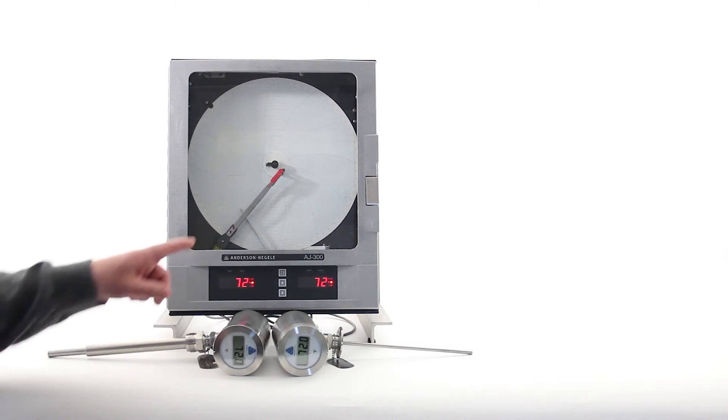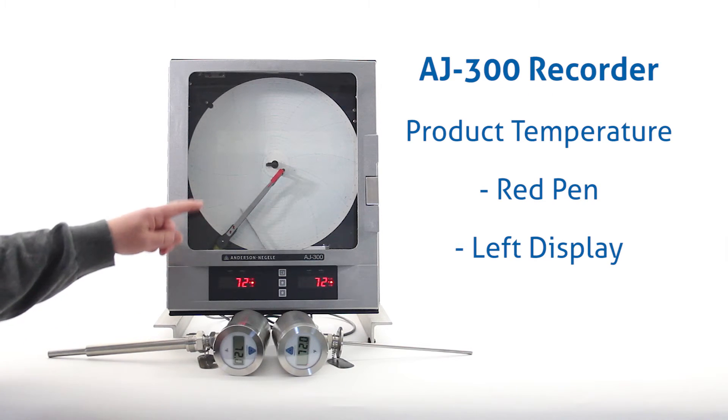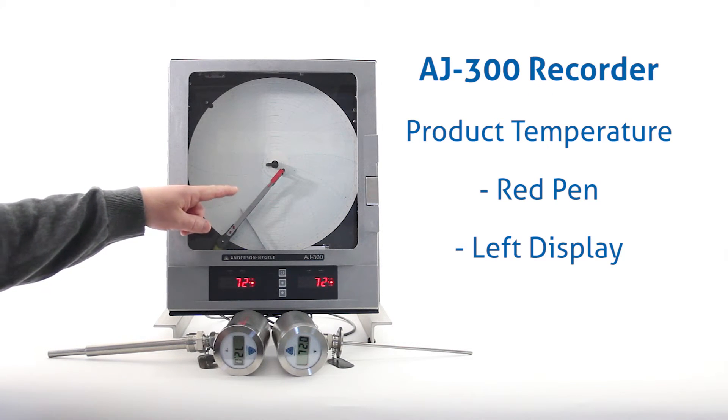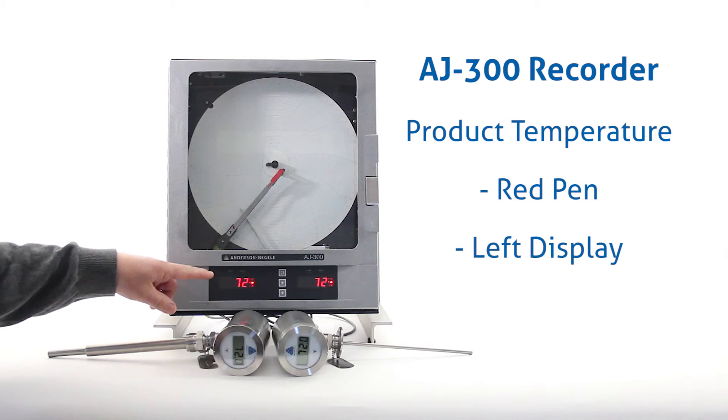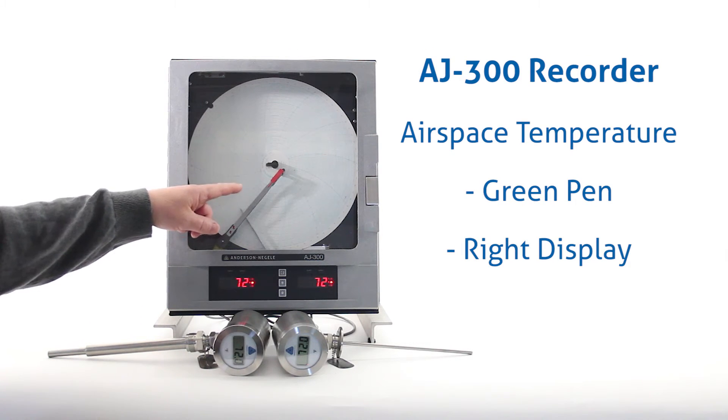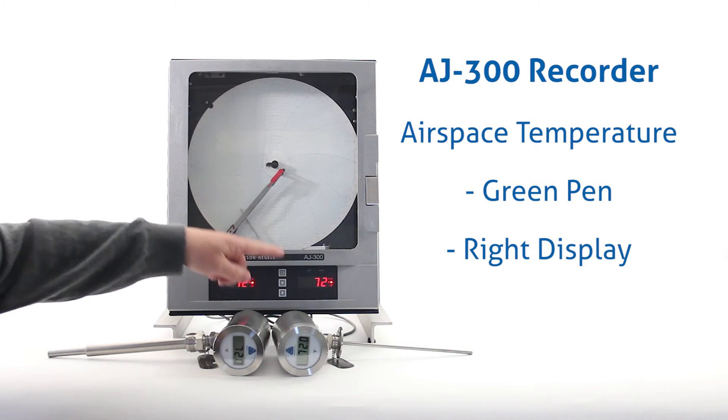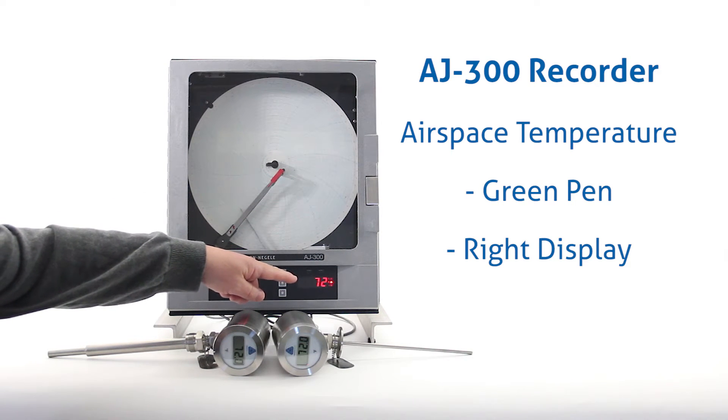The first component is the AJ300 recorder, which records the product temperature with the red pen and displays the product temperature on the left hand display. It also records the airspace temperature with the green pen and displays the airspace temperature on the right hand display.